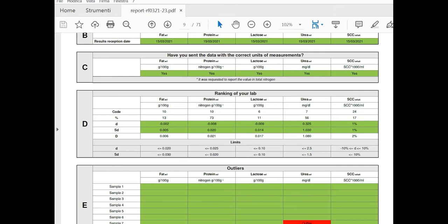The limits for the green or red icon are only indicative, and so far do not constitute standard values. They indicate what is normally reachable by labs, for their self-evaluation. The ICAR Milk Analyses Subcommittee is monitoring these limits, and eventually will update the limit of the box to evaluate the accuracy.